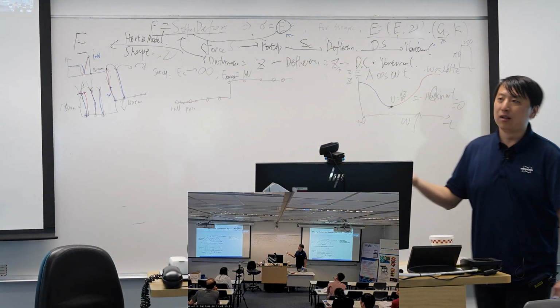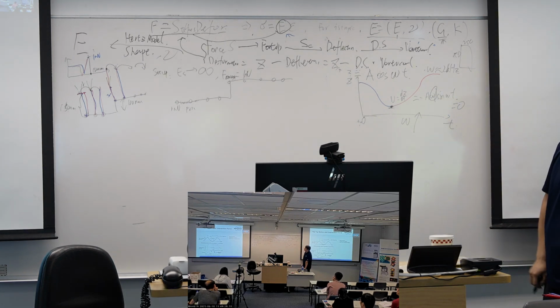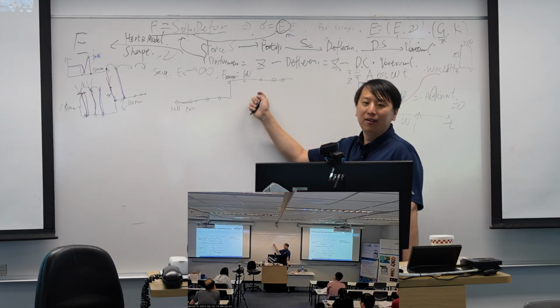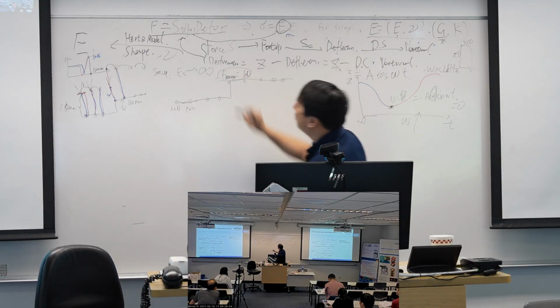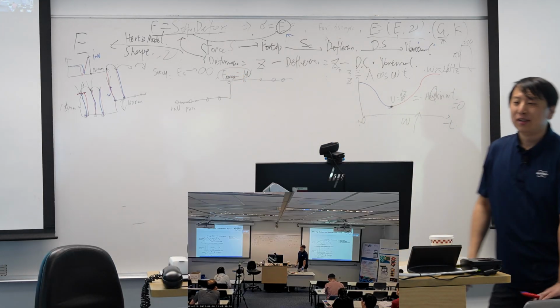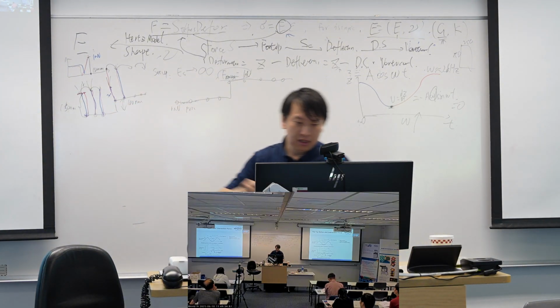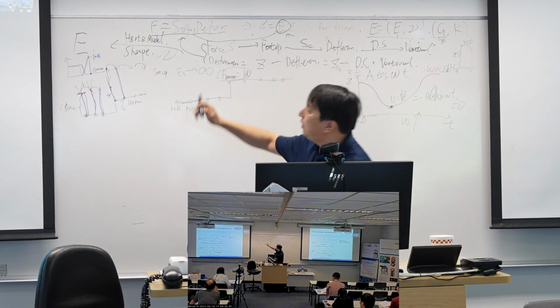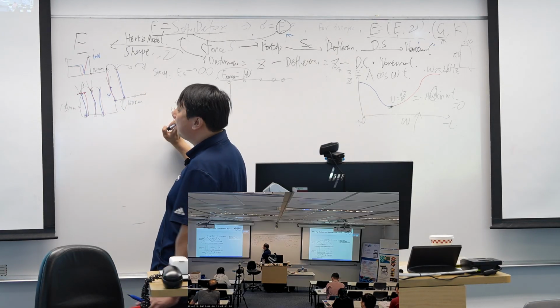That's the whole idea: using the force curve to do the morphology of our sample. So the morphology we get is when we reach the force at 1 nN. That's the force curve.